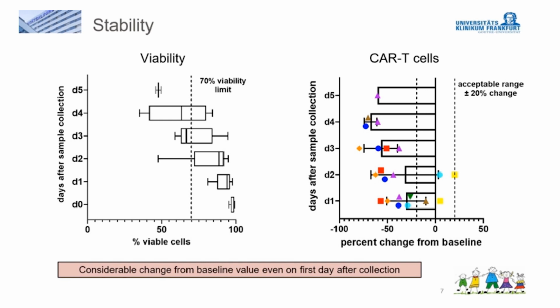In evaluating these results, it must be said that the CAR T cells in the peak strongly gave the impression of being really exhausted. We have analyzed other markers as well. However, I will not go into that in detail of exhaustion here now.